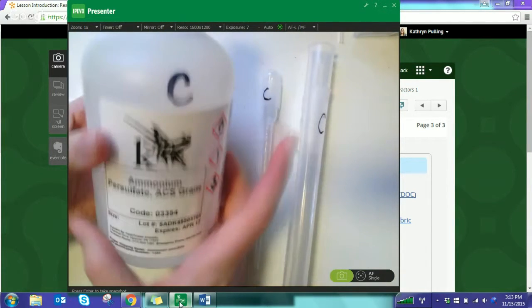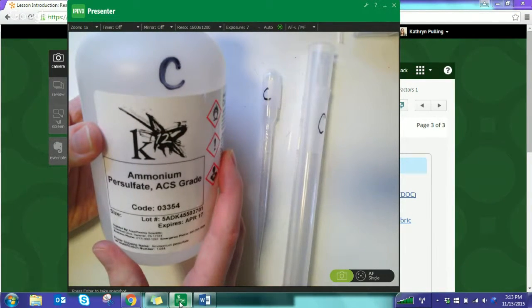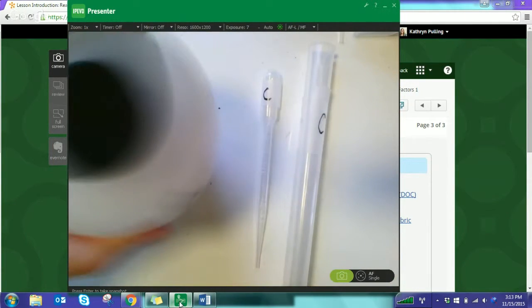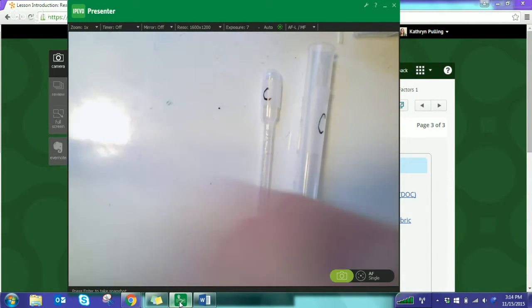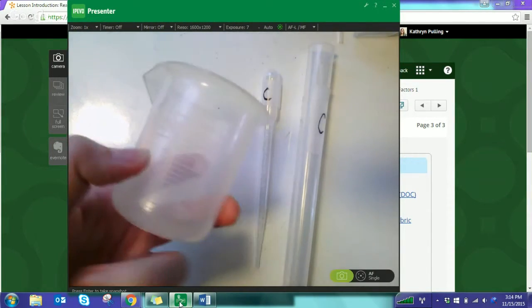This one doesn't come already liquid as aqueous, so you have to add water to this one. You need to add 400 milliliters. To do that, I used one of the bigger 250 milliliter beakers. I just filled it to 200 twice and poured it in. Then swirl it around until you make sure that you don't see any solids left at the bottom. I also have water in a beaker ready for when I need water samples or extra water with the pipettes.